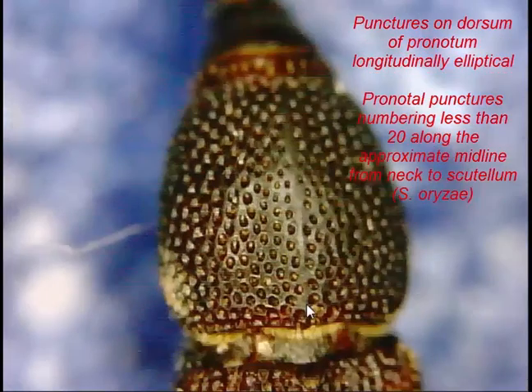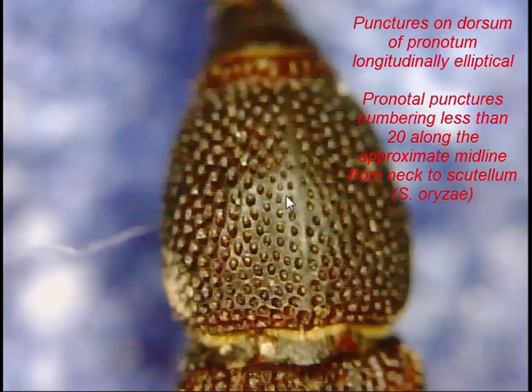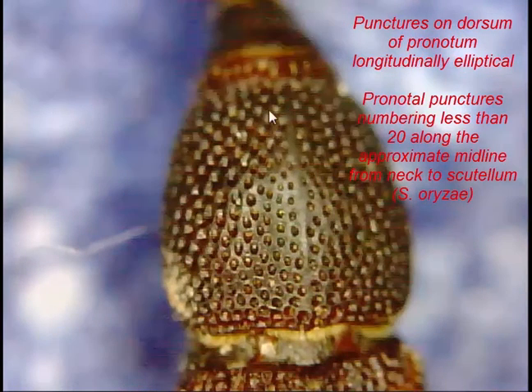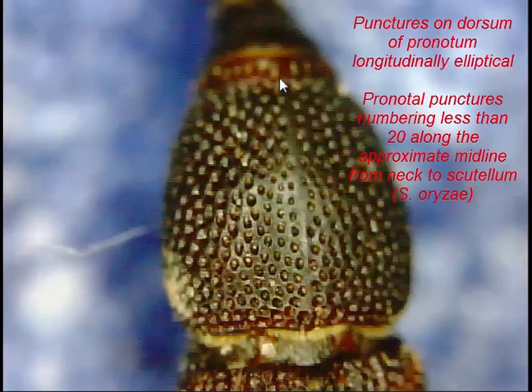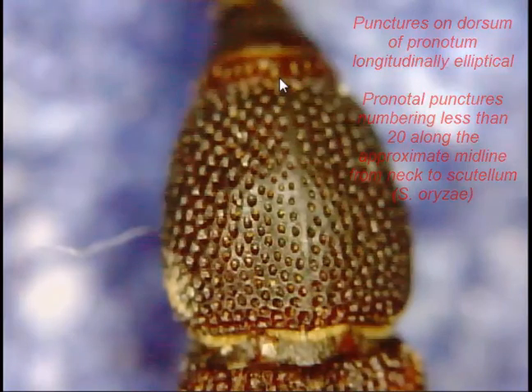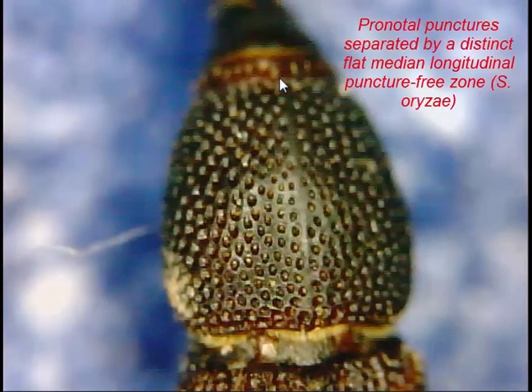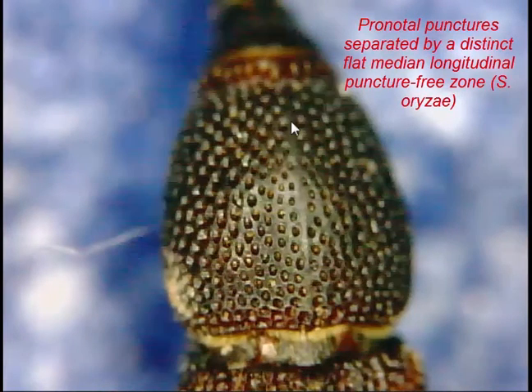Compared to Sitophilus oryzae, where there are usually fewer than 20. Counting up the middle: 1, 2, 3, 4, 5, 6, 7, 8, 9, 10, 11, 12, 13, 14, 15, 16, 17, 18, 19 — maybe 20 spots. You'll also notice that down the central line of the pronotum there is an area that's clear of punctures, which is supposedly a common feature of Sitophilus oryzae, although in several specimens this hasn't been apparent.